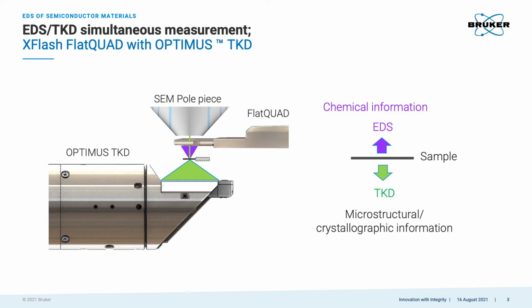We can also have a bulk specimen in SEM and then look on length scales like several tens or hundreds of nanometers, micrometers. Since I'm coming from TEM, I'm not sure I will be able to cover all, but I know failure analysis of devices, device parts, wafer parts, or full wafers is being done with EDS on SEM.